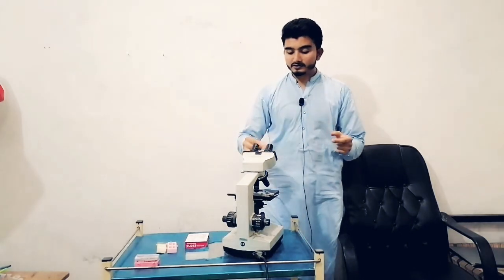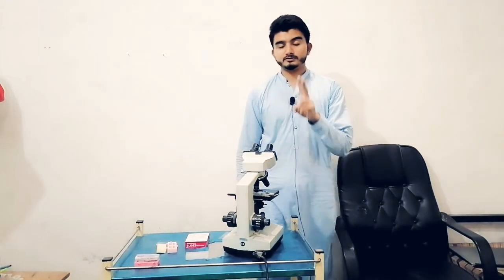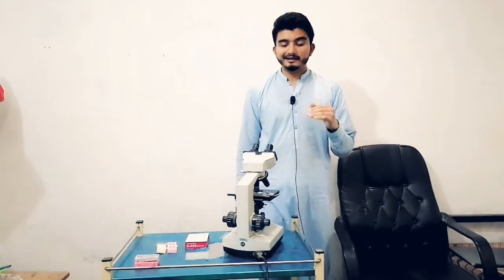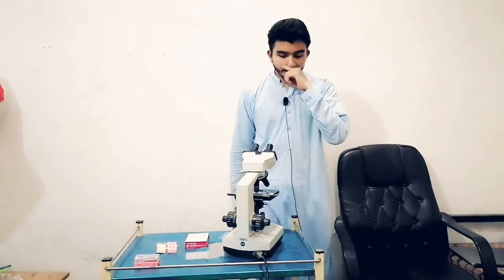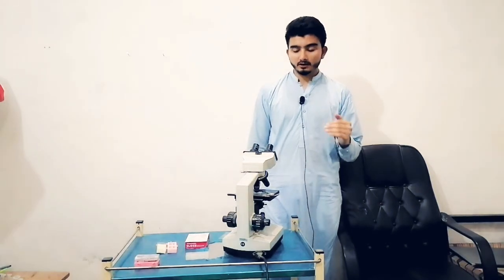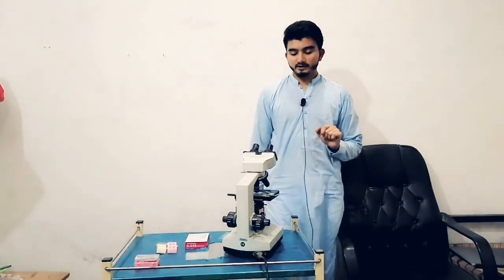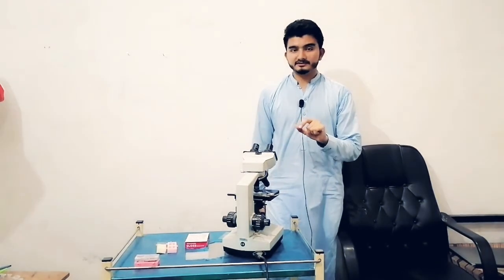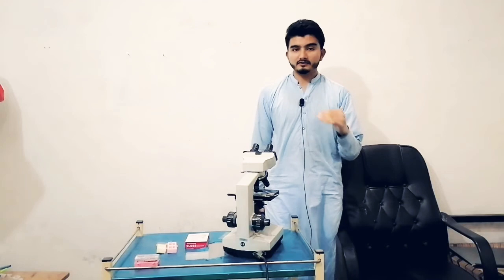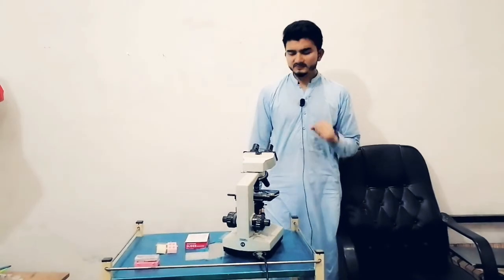Now what should I do? There are two things which are very important in microscopy. First is coarse focusing, and another is fine focusing. Initially you should do coarse focusing, then you should do fine focusing. For urine focusing, you should use the 10x lens. If you focus the urine on the 10x lens, then you will properly magnify it and get resolution and contrast and magnification properly at the 40x lens. So that's all about the urine.